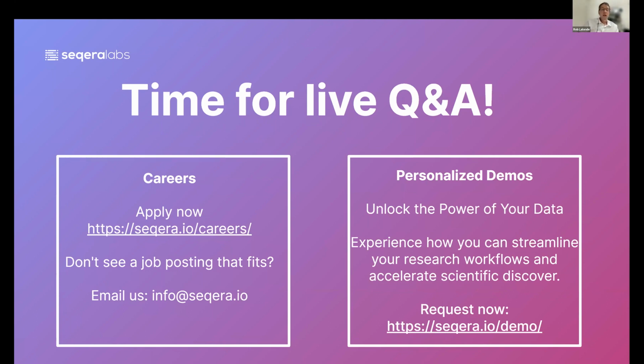So now let's jump in and address some of your questions. Just going to look quickly at the Q&A here. So Joshua Davies asks, is there a way to automate the generation of the pipeline tube map diagram?